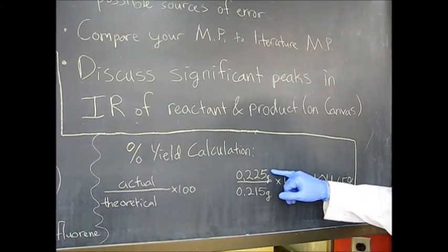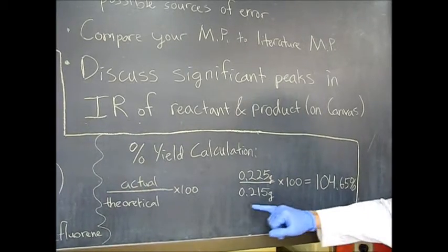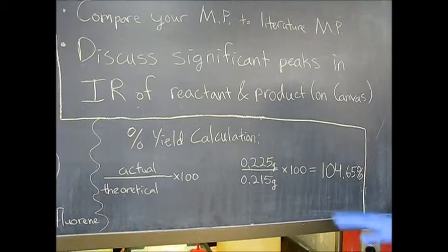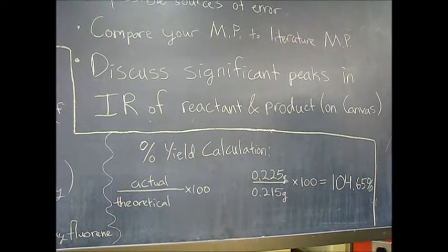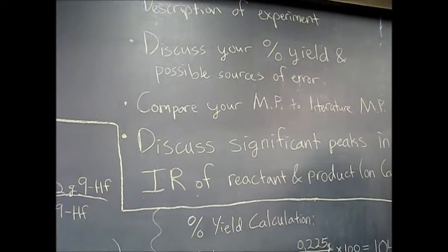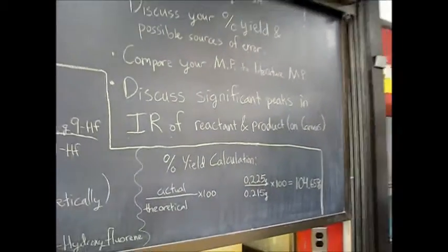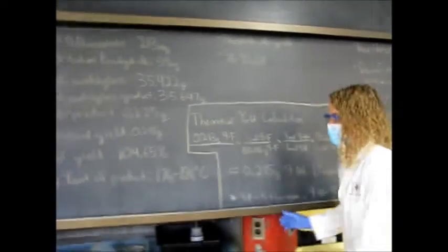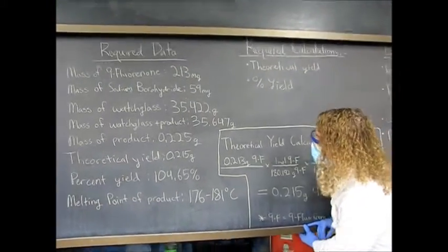For the percent yield, it's actual over theoretical times 100. So we actually got 0.225, whereas our theoretical was 0.215. Divide those, multiply by 100, you get 104.65% yield. A percent yield over 100% shouldn't really be possible. If you get something like that, it calls into question the results of your experiment.